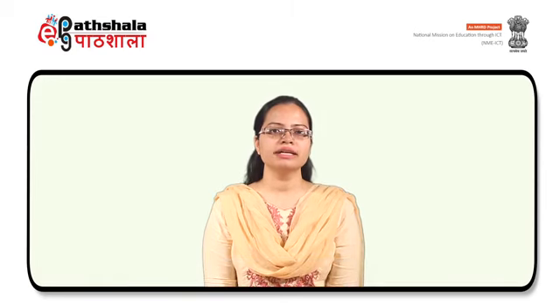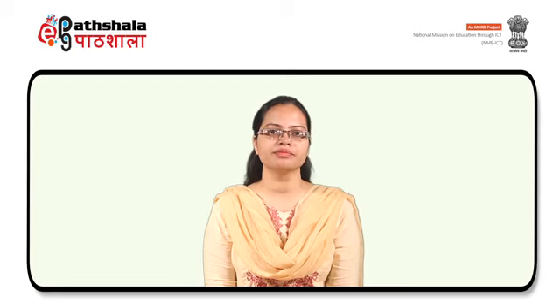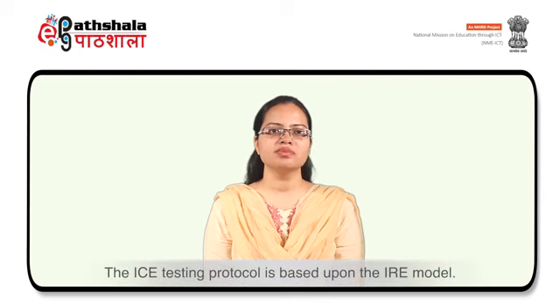The chicken enucleated eye test, also known as the isolated chicken eye test, is widely accepted to be a reliable and accurate slaughterhouse tissue model for assessing the test material's eye irritation potential. The ICE testing protocol is based upon the IRE model.